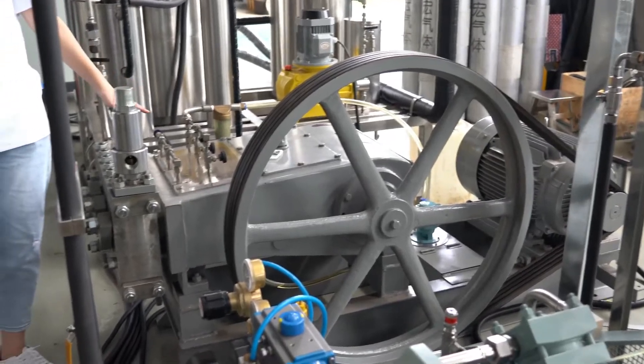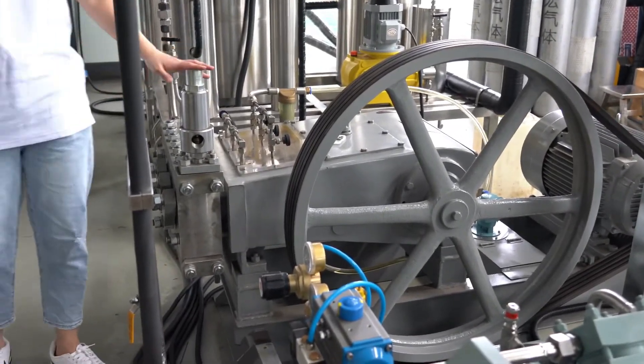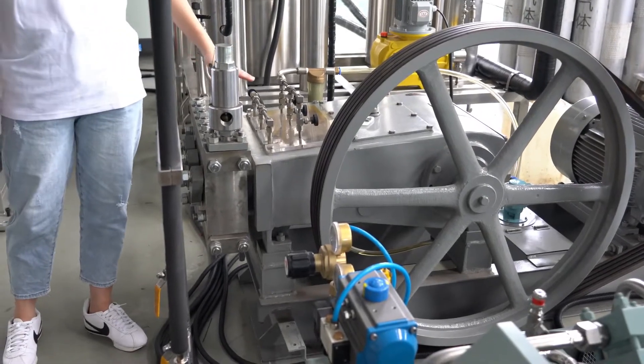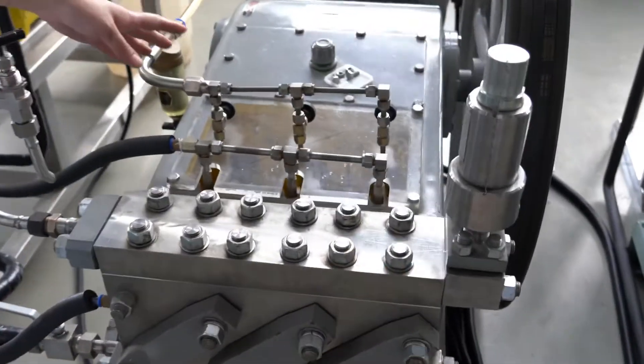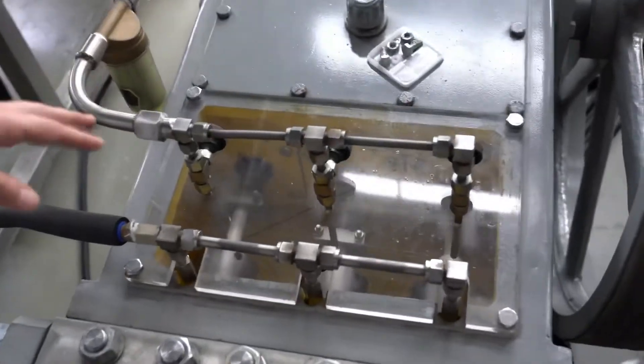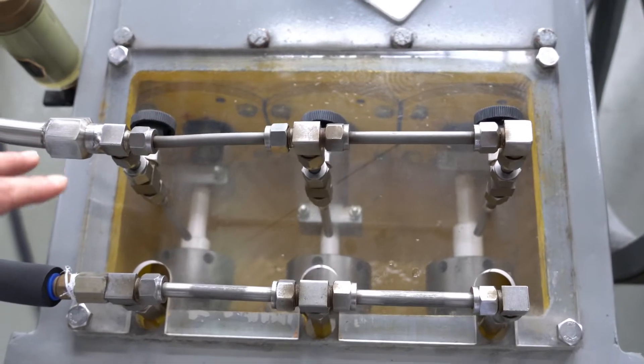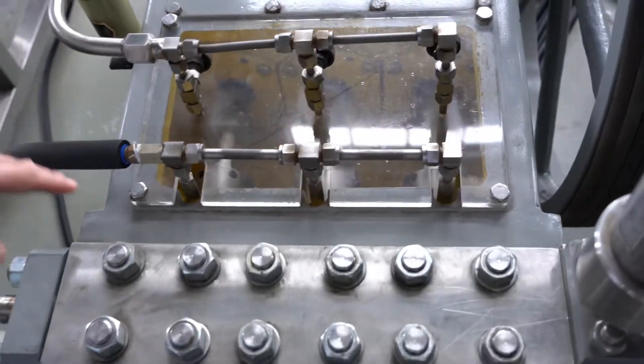Thirdly, this pump can function quietly and noiselessly. Fourthly, the pump is made of high wear-resistant material. Lastly, it is very easy for the pump to cool down.